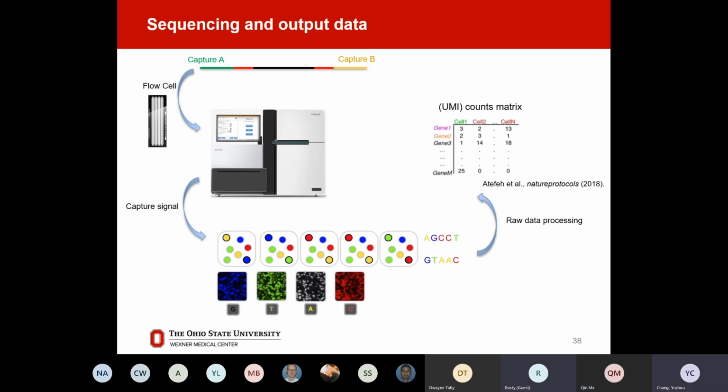Yeah, it's a good time to ask questions, and this is a nice job of visualizing what actually happens. I think that's one thing that's lost, particularly with computer science. As you said earlier, understanding how the data was collected also helps you understand the validity of the data. So it's not just taking a sequence as letters ACGT. You also understand how it was generated, because there are error rates that come along with this, and sometimes variants in the sequence could just be due to error rate. So we'll open this up to the students to ask some questions about data collection in this way and the algorithms that were written to convert it, and what the error rates are.